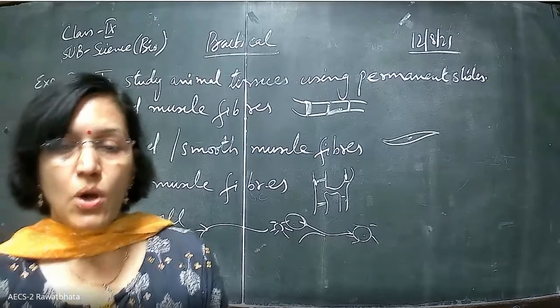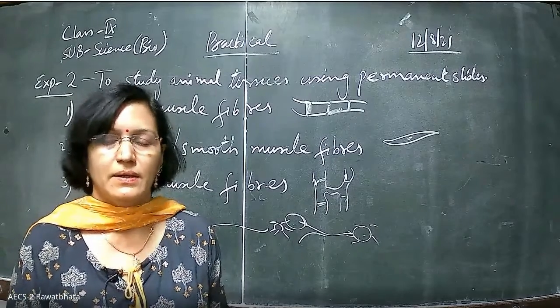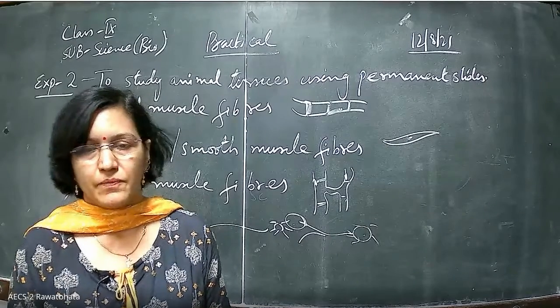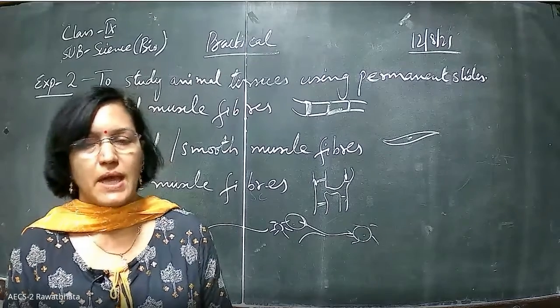So that's all from my side for this particular practical, that is study of the permanent slides of plant tissue as well as animal tissue.